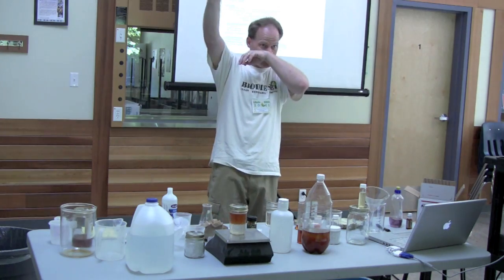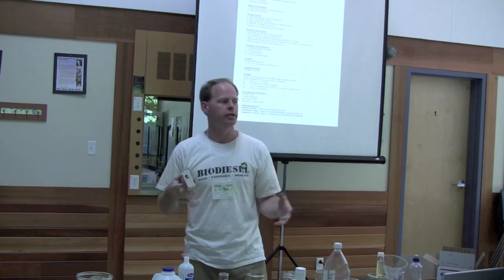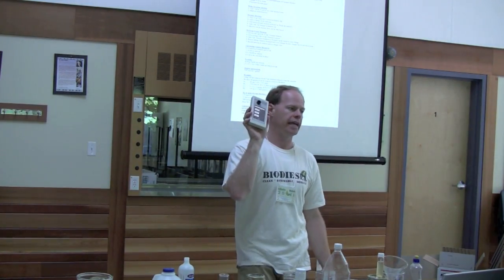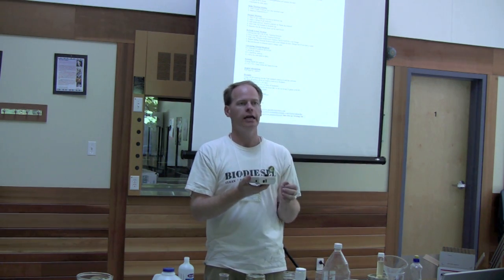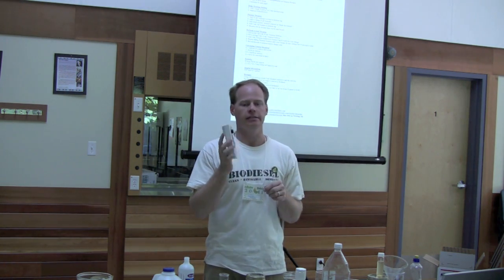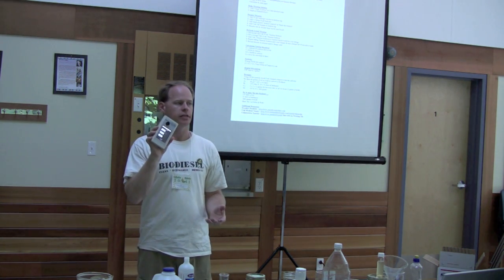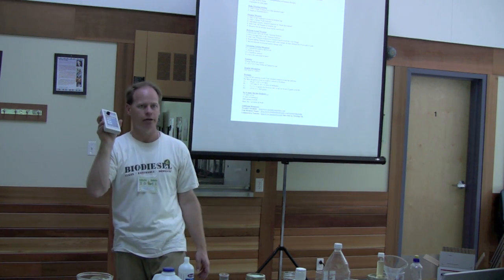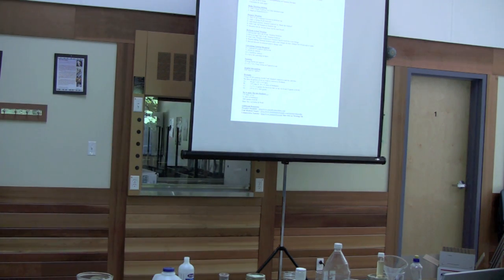This is something you can see for testing more accurately. We won't keep you in here, but this is an analyzer that takes these basic tests, throws them out the window, and is almost as good as a gas chromatograph. It's as accurate as a gas chromatograph. You can take a sample of oil, put it in, press the button, and it'll tell you exactly what your total glycerin level is, your free fatty acid level, and your acid number. So if you want to go on a commercial scale and you need something extremely accurate, there are devices on the market that are alternatives to gas chromatographs, as accurate and a heck of a lot cheaper to use. Six grand buys you a whole kit.